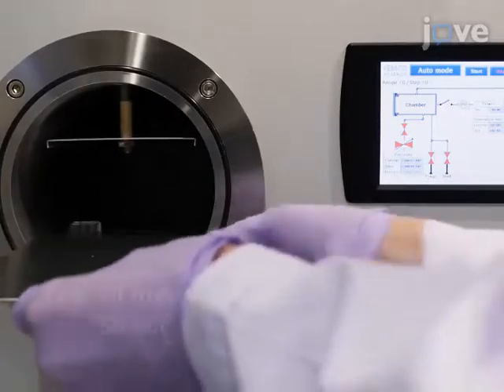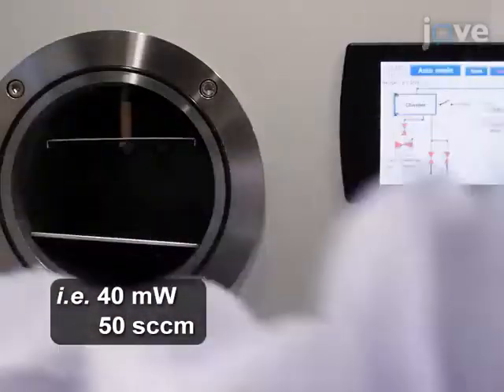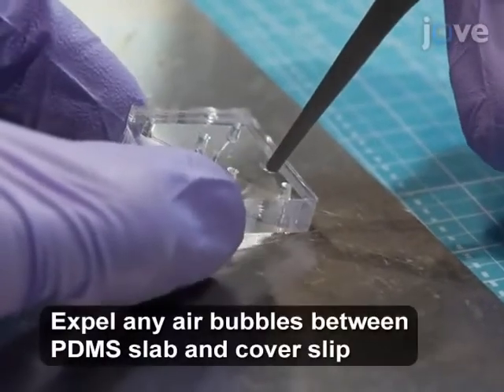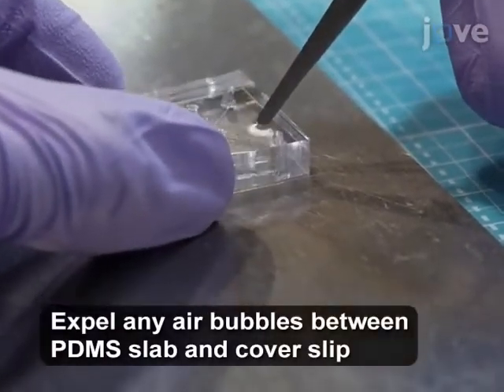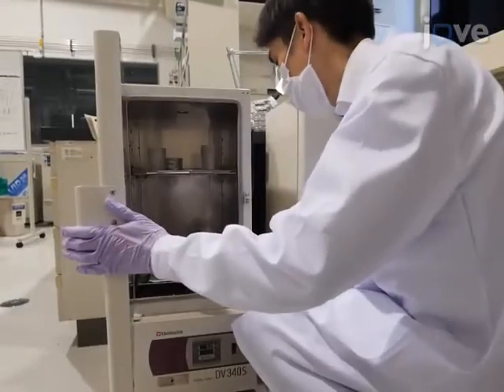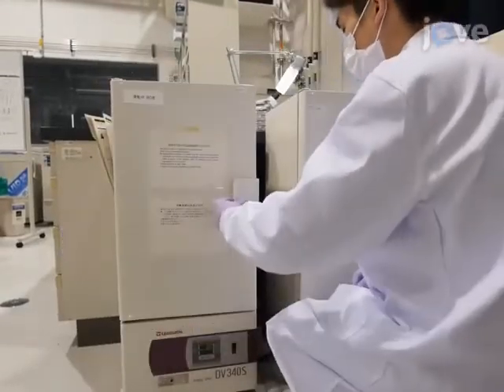Treat the clean slab with air plasma for 40 seconds and bond the PDMS slab onto the coverslip. Then cure the PDMS at 80 degrees Celsius for at least 12 hours.